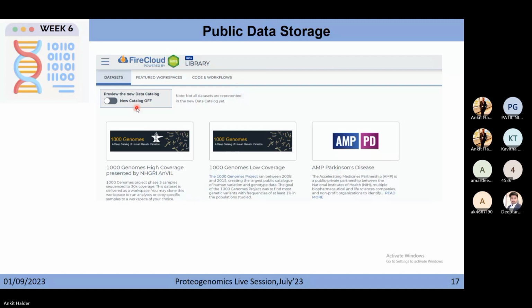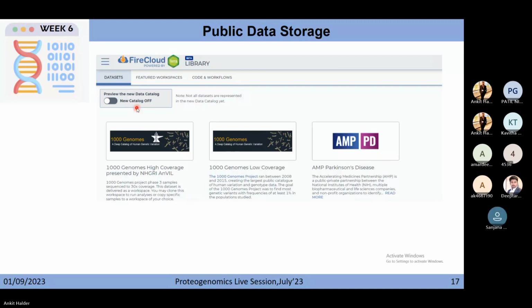So you can find the different proteins, and these automated scripts and analyses help you, where you can easily follow the analysis steps and analyze the results for different data sets.